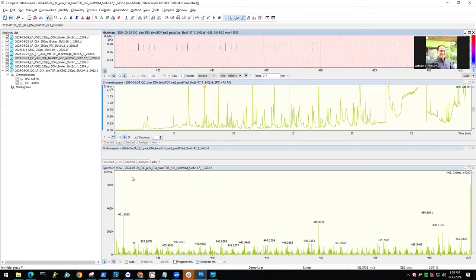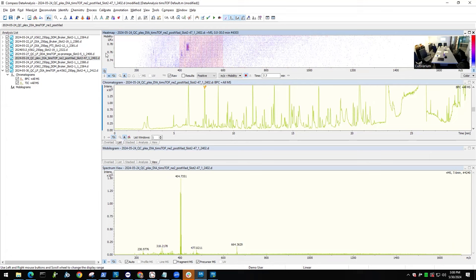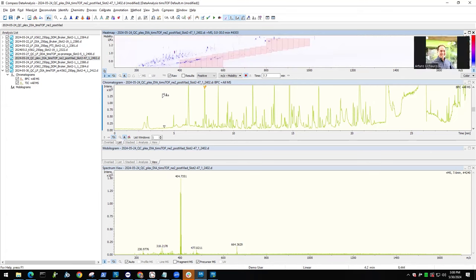So let's zoom out here again. As I was saying, we go through these combinations and acquire the data. And then we need computational tools to dig into these data, because the more samples you have, the more complex it gets. And that's something that Rupe will explain to you later on, how we actually extract all the information out of it and what is important to look out for.